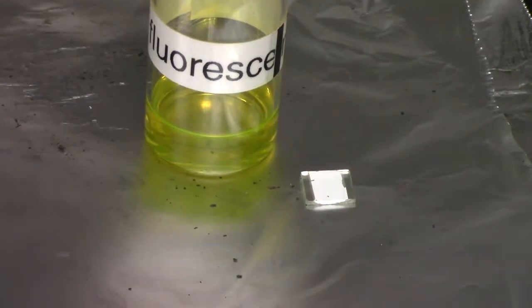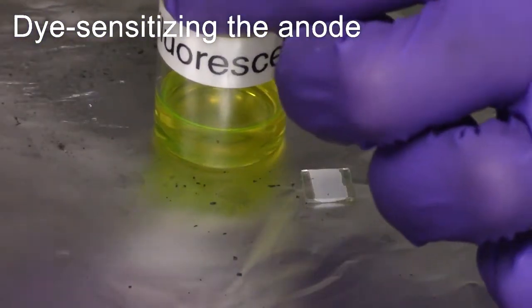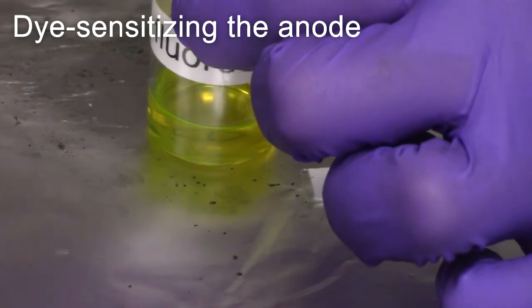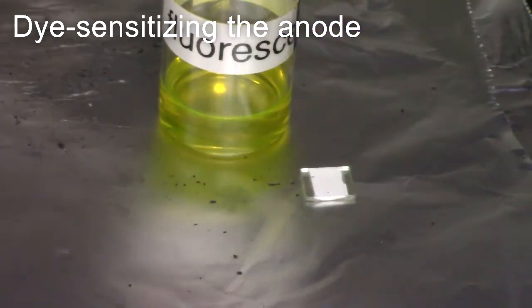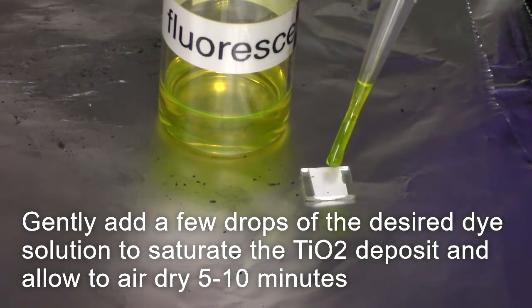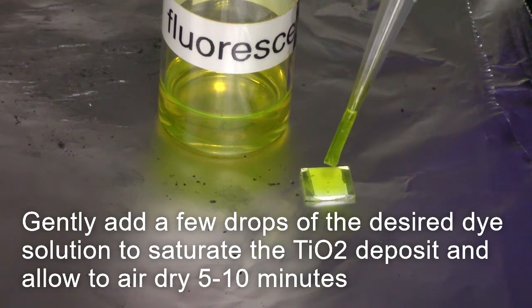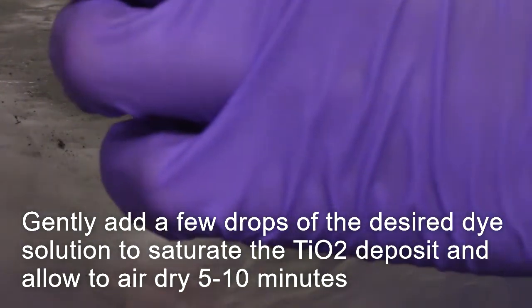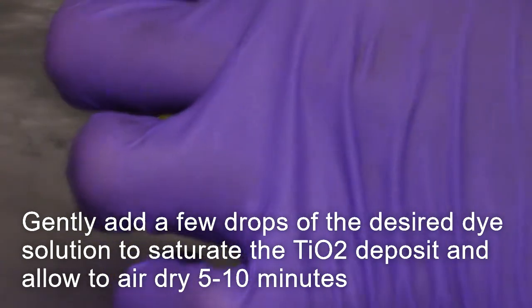The dye sensitizing process of the anode can begin. Take a small amount of the desired dye and gently place a few drops on the TiO2 deposit, just to saturate it. After which allow 5 to 10 minutes for the dye to completely dry on the TiO2 glass surface.